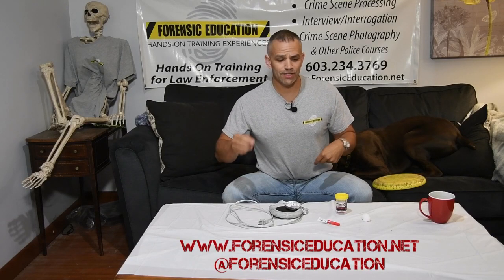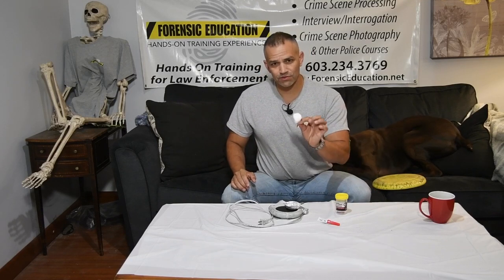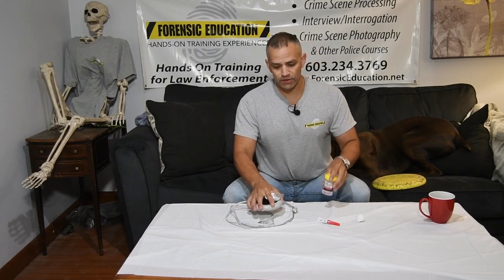Welcome back to Forensic Education. I'm Mike McCutcheon and today I'm going to show you an inexpensive way to superglue fume if you don't have access to other materials.